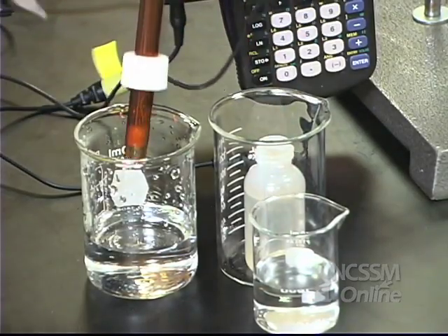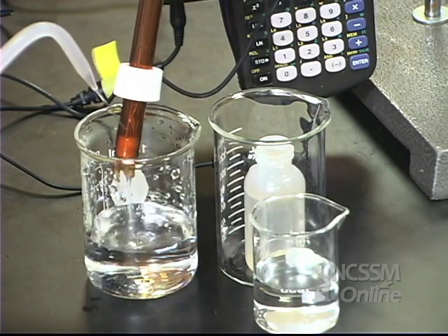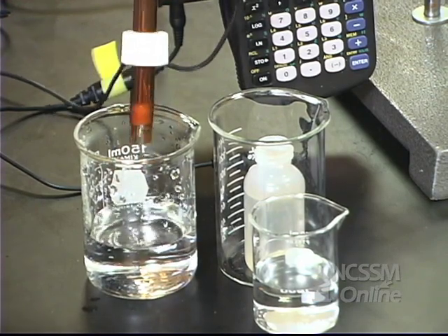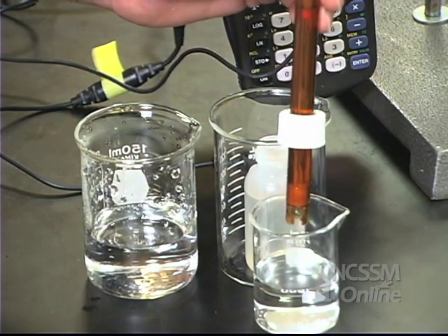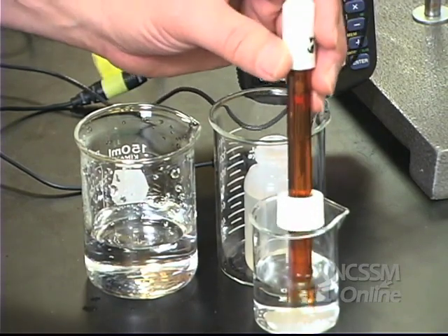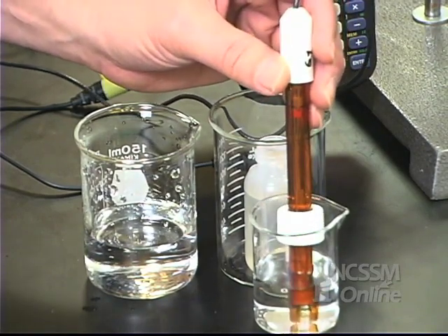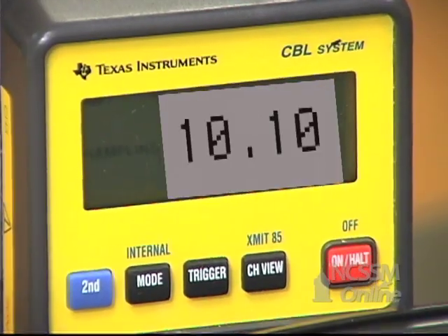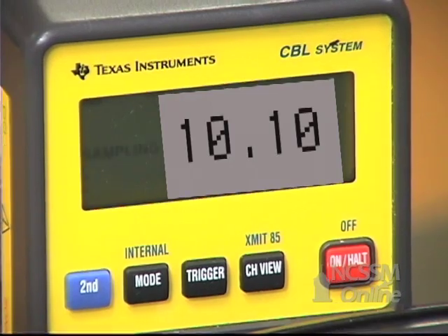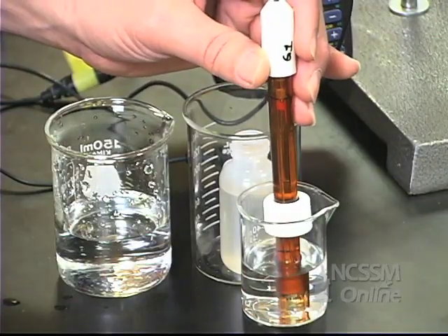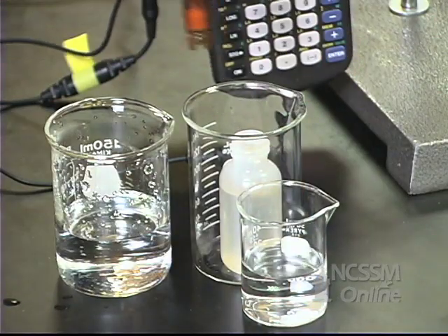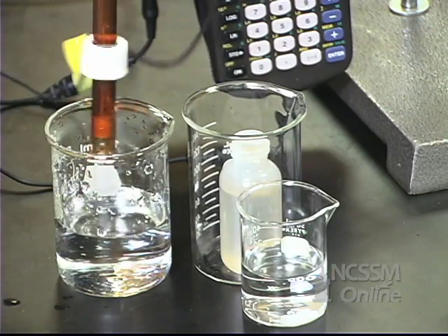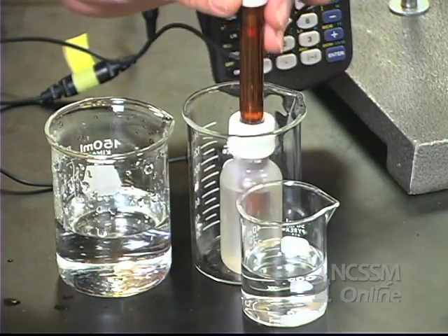We're going to take our pH probe out of the storage solution and put it into a saturated solution of magnesium hydroxide. We're going to read the pH off the CBL, then remove the probe from the solution, rinse it with distilled water, and put it back in our storage solution.